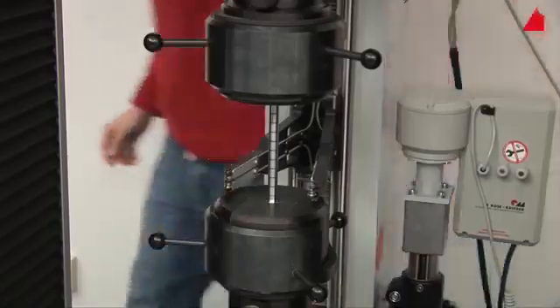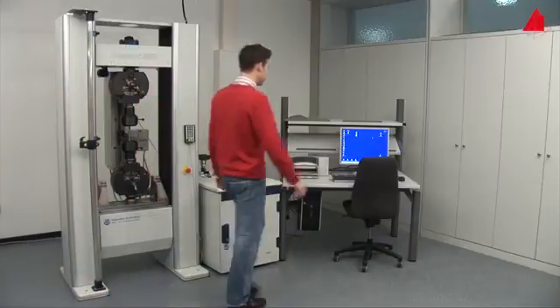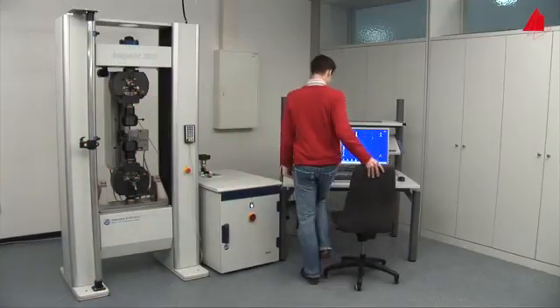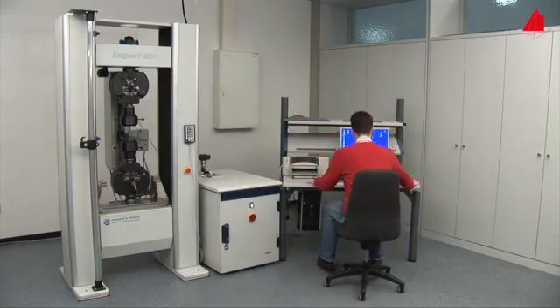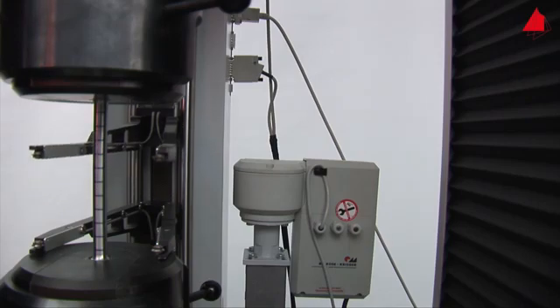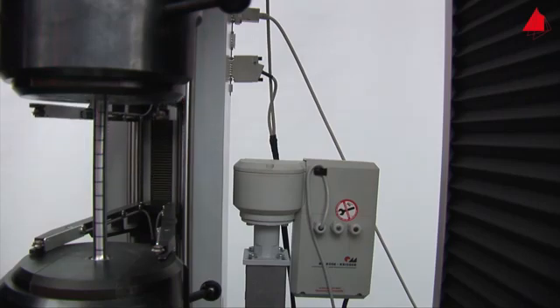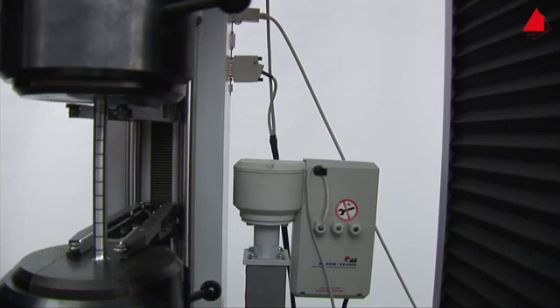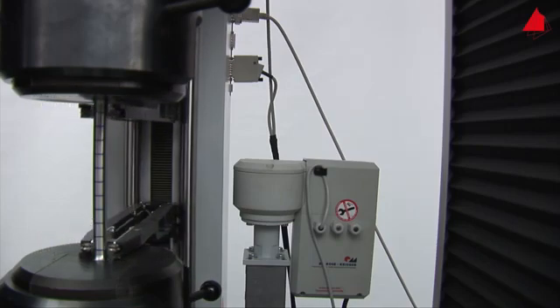Then he selects all necessary testing parameters on the control computer. Ready. The test starts and the extensometer sensor arms are carefully pressed onto the test piece. This way the gauge length can be measured throughout the whole tensile test.